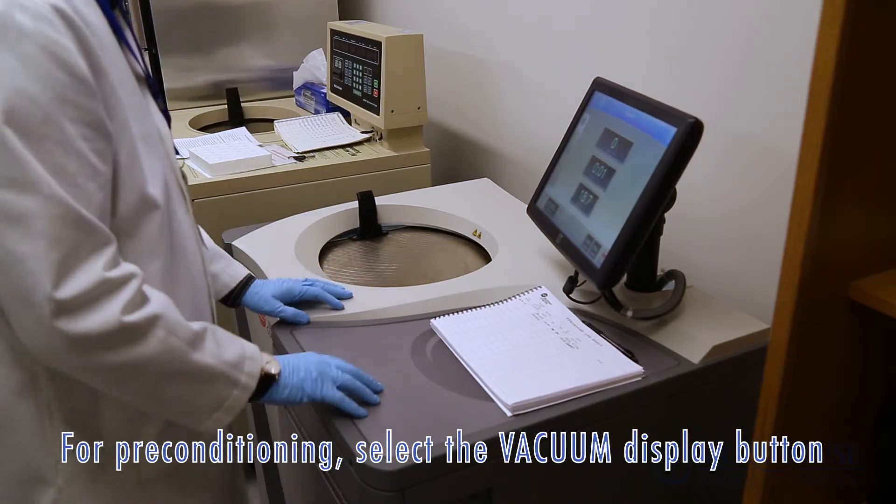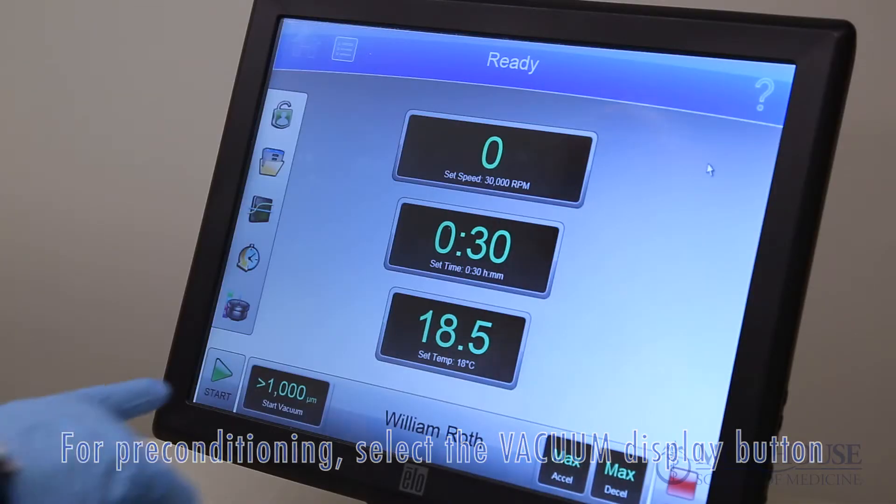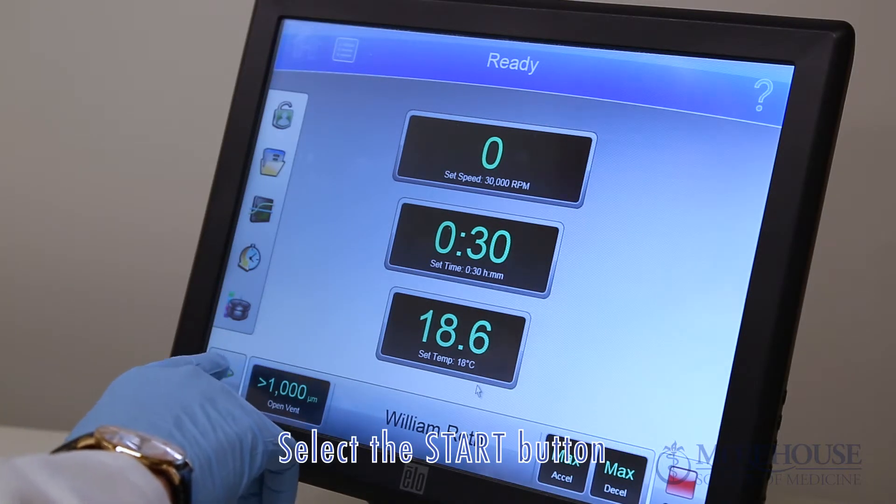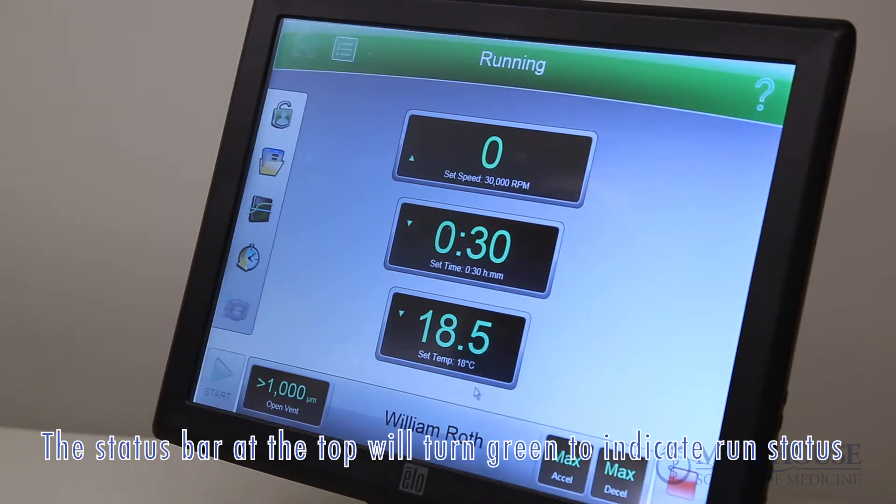For preconditioning, select the vacuum display button and wait until the chamber reaches the set temperature. Select the start button. The status bar at the top of the screen will be green to indicate the run status.